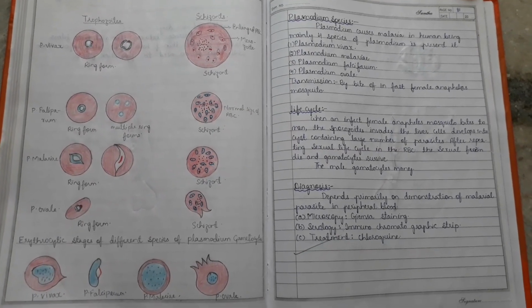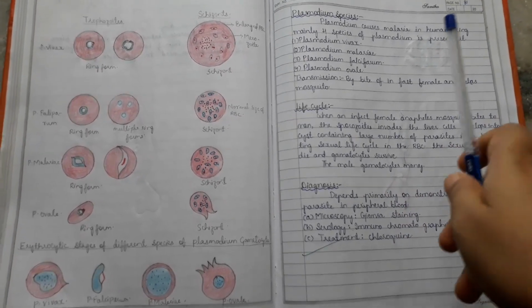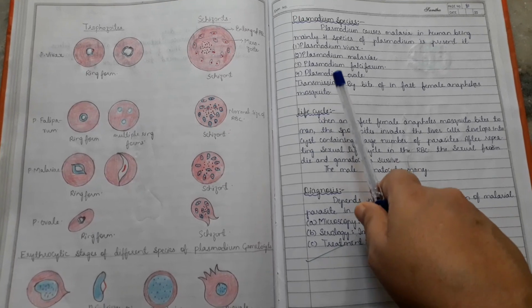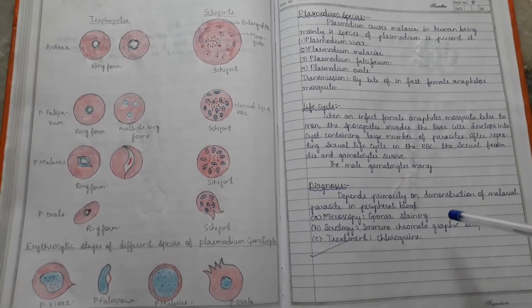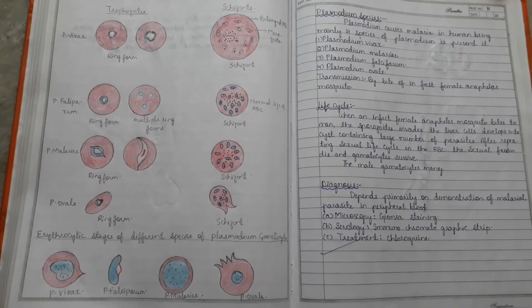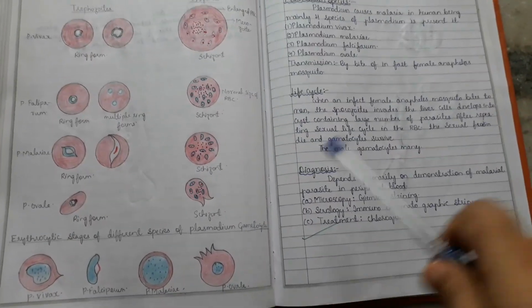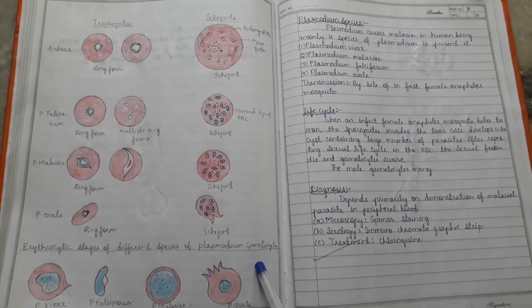So Plasmodium species cause malaria in human beings. These are mainly of four types: Plasmodium vivax, malariae, falciparum and ovale. Transmission happens with the bite of the female Anopheles mosquito. This is the life cycle and the diagnosis. This is a picture of trophozoites and schizonts, the erythrocytic stages of different species of Plasmodium, and gametocyte.